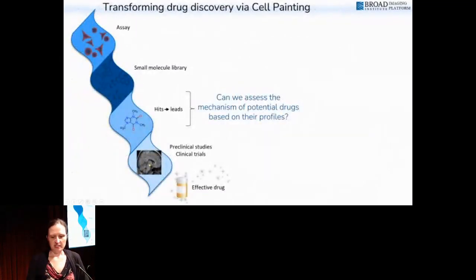Yeah, I love this whole line of questioning. So, mRNA profiles and image-based profiles. We've only directly compared the L1000 mRNA profiles, which are measuring only 1,000 mRNAs, not a full gene chip, not RNA-seq, although there are some studies that indicate that they're equivalent to RNA-seq bulk profiles. But in any event, the L1000 mRNA is what we've compared directly to. And the feature space is very different between measuring distinct mRNAs versus these image-based features, many of which are quite redundant. So we do need to do some pre-processing to try to make them more resemble each other.